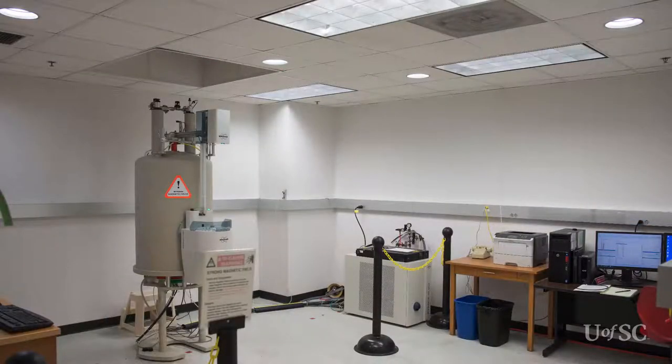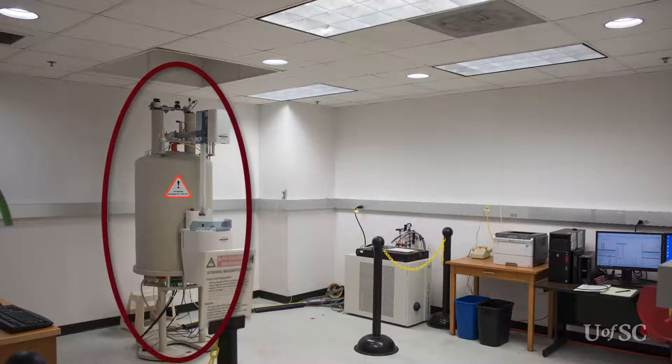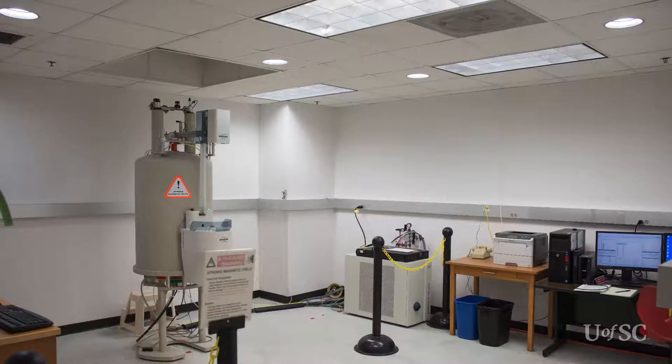Let's take a quick tour of the 300 lab. The most prominent feature of an NMR system is the superconducting magnet. The magnet contains a solenoid with windings running parallel to the floor. An opening called the bore runs the full length of the magnet's dewar or cryostat. Within the bore a probe is mounted from the bottom. This probe detects the NMR signals that we collect for each experiment. Samples are inserted into the bore from the top.